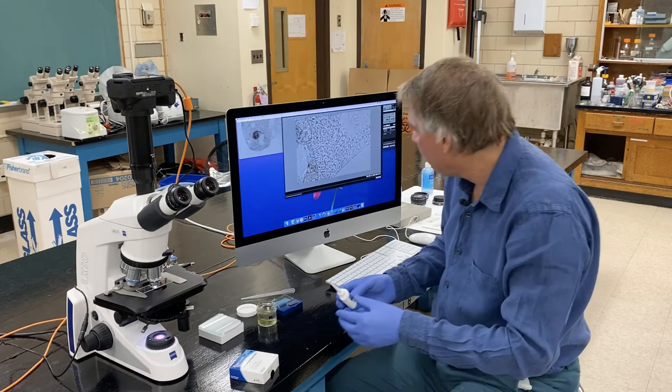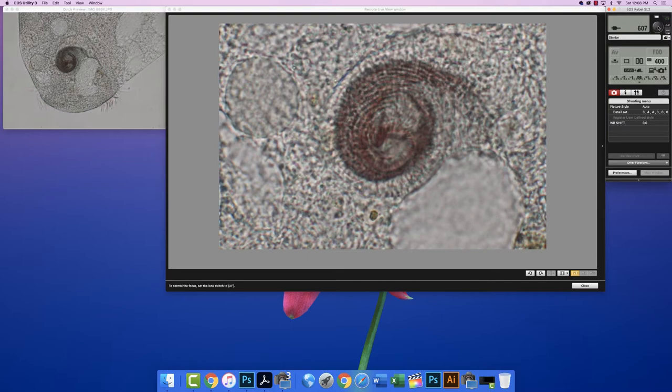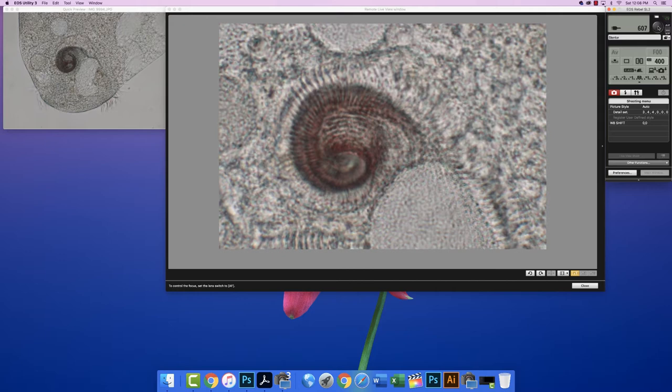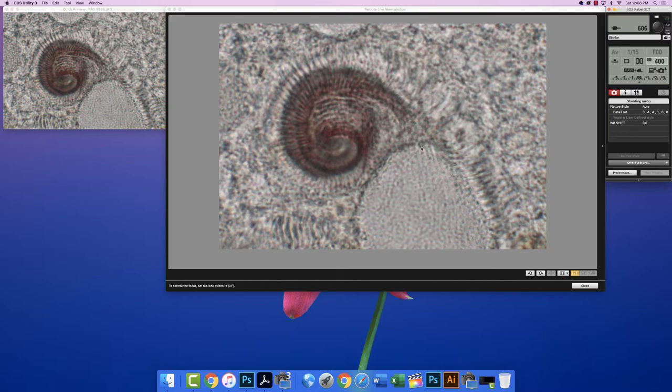And here's our critter still. And try to find a, you know, let's look at this again. Whoops. And here we have to pick what we want to be in focus, because it's a very shallow depth of field and the entire subject can't be in focus in this particular case. So I'm trying to focus on this region right in here.